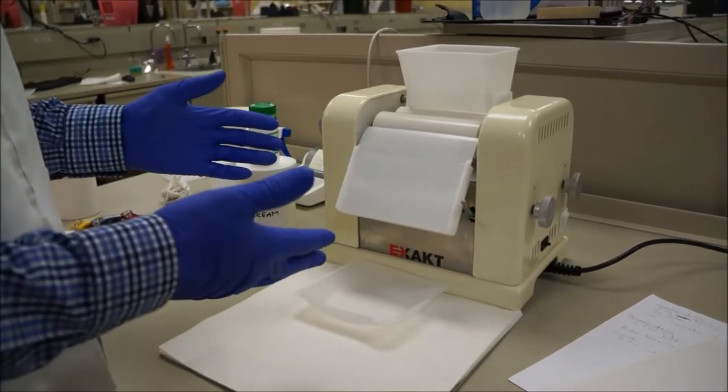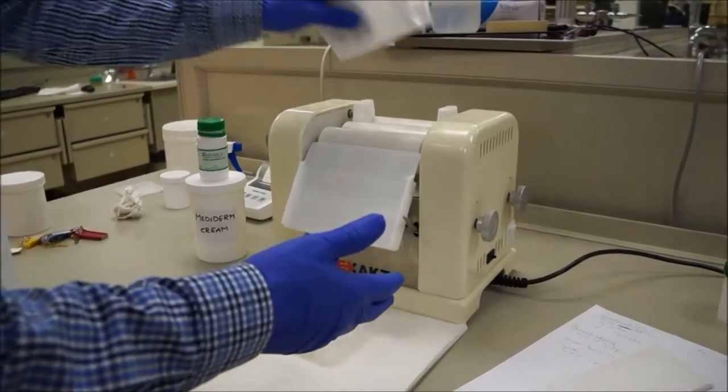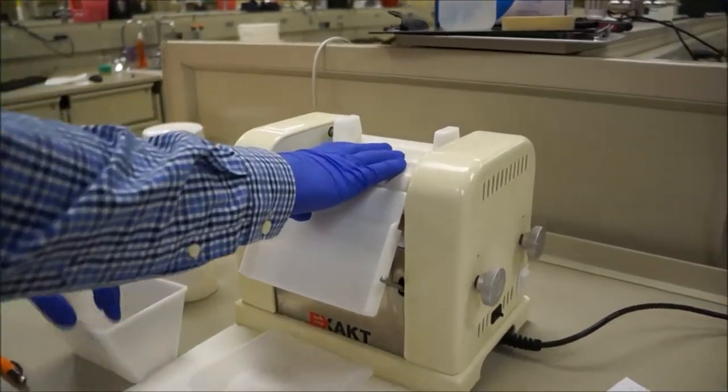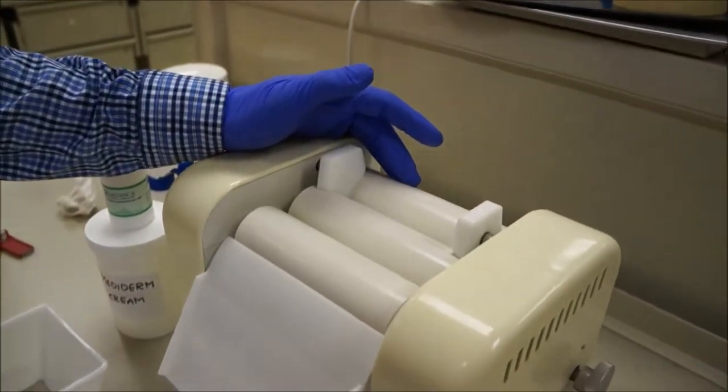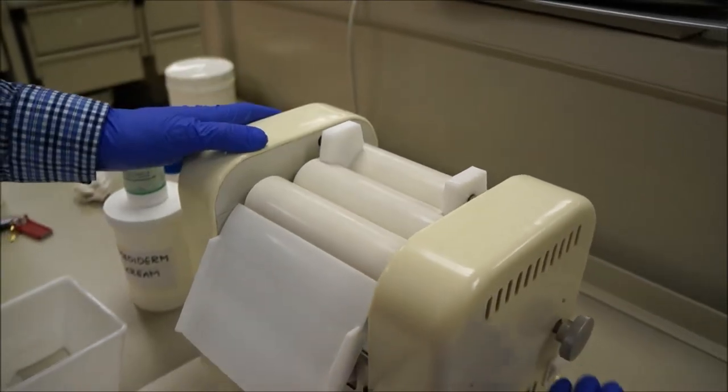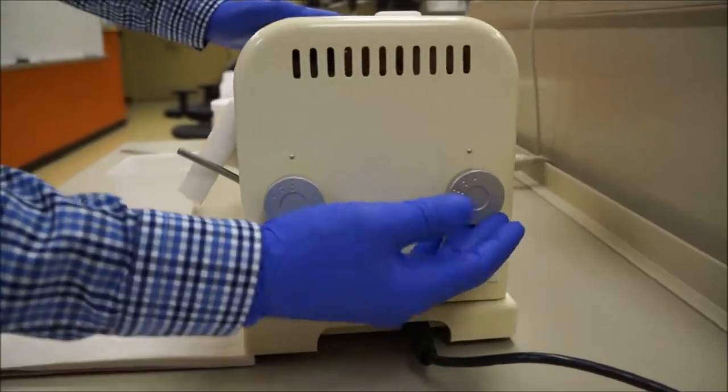Okay, so today we're going to be talking about the ointment mill. This is it as you can see. There are hard ceramic rollers here on the front, back, and in the middle. On each side there are adjustment knobs.